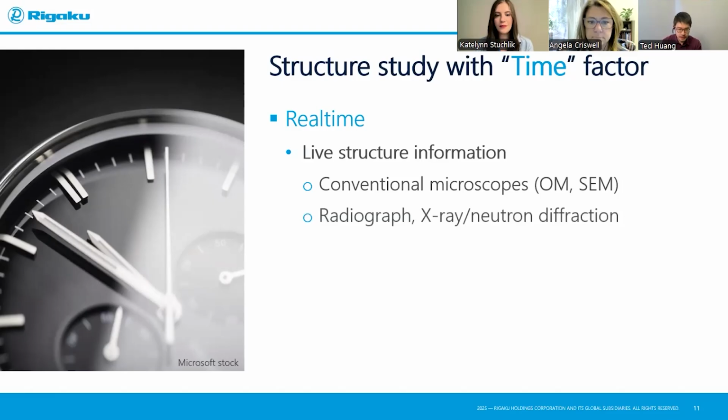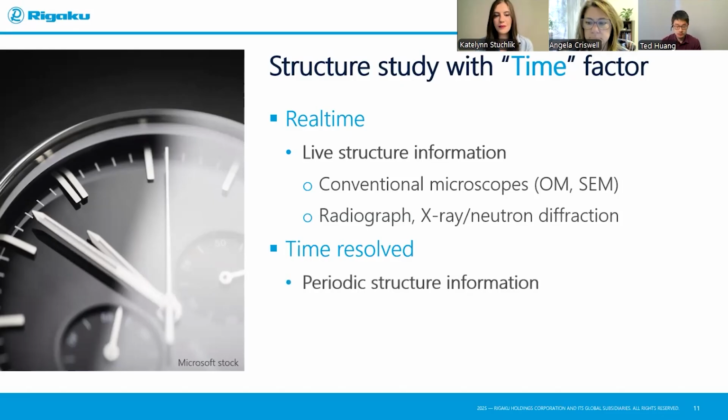Or you're doing radiograph or X-ray neutron diffraction, reading live. That is also real-time study. Now, it doesn't have to be real-time all the time. It can just be time resolved, meaning you have a periodic structure information update, not live, but still very frequent, or the frequency depends on the tool you're using. Like X-ray CT is one example.